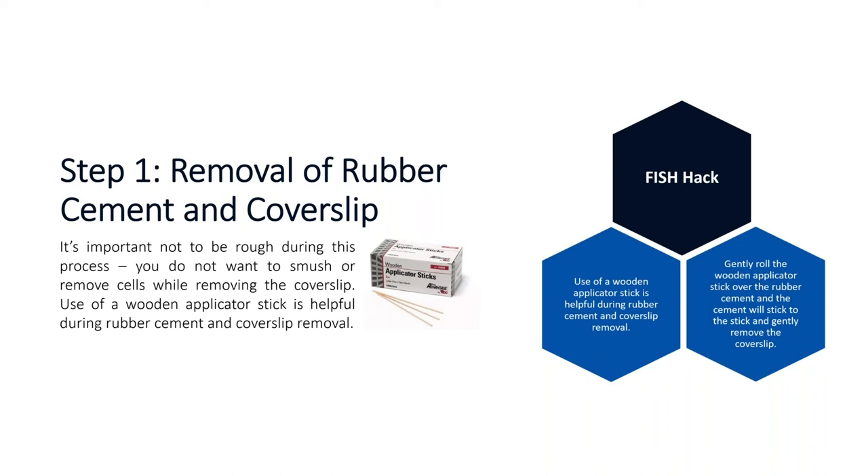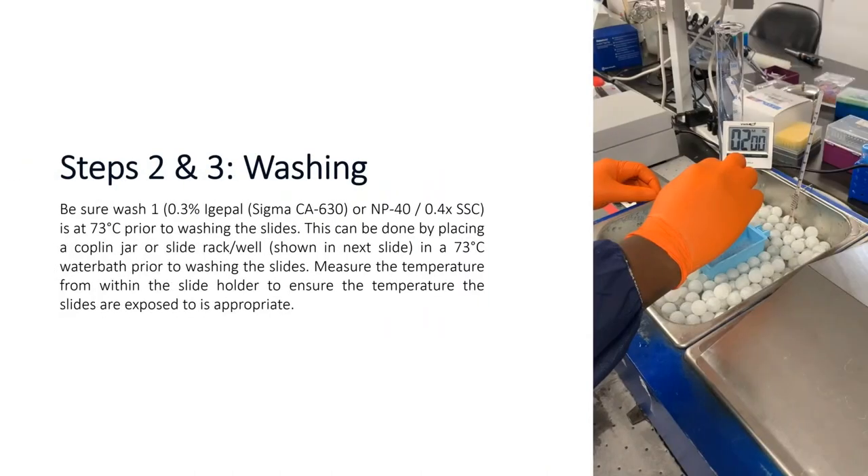For steps two and three — the actual washing process — the big thing is to make sure your hot wash is actually getting to the proper temperature, which is 73 degrees Celsius, prior to washing the slides. Place your thermometer into the Copeland jar or the slide rack well to make sure the temperature within the jar is at 73 degrees Celsius. If the thermometer is outside the jar, the fluid may read 73°C but the solution inside may be lower, and you won't get a good wash.